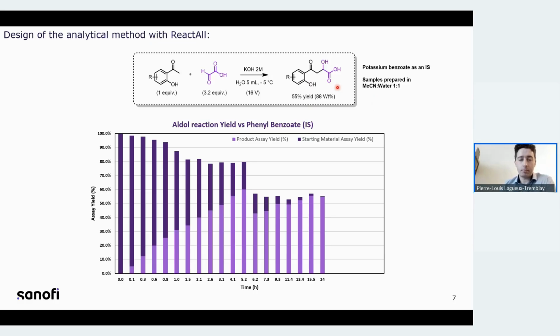through the generation of small samples, because these samples tend to decompose over time. If they are taken and sat at room temperature, because of the sitting with the base, even in the sampling stage, they start to decompose. So we saw this inconsistency due to poor sample stability. So this was very challenging to do.